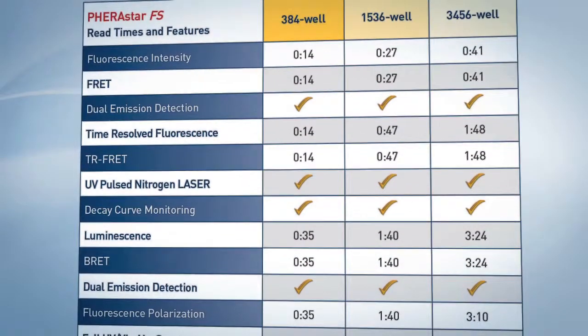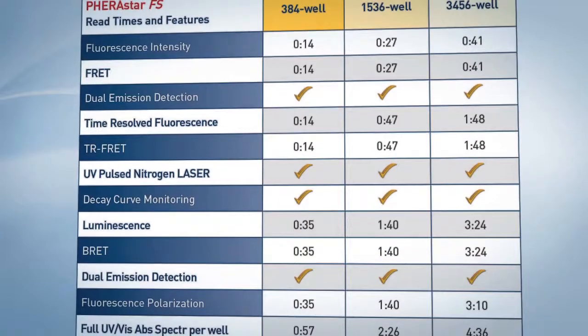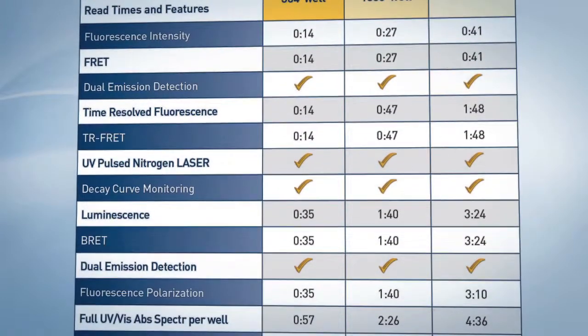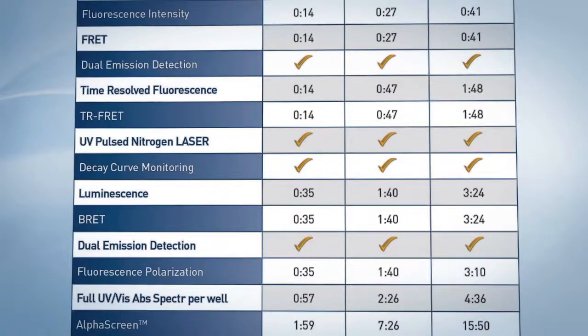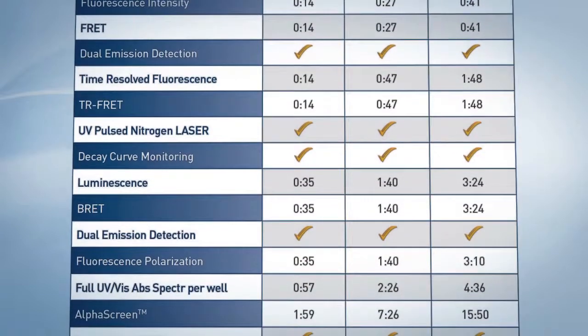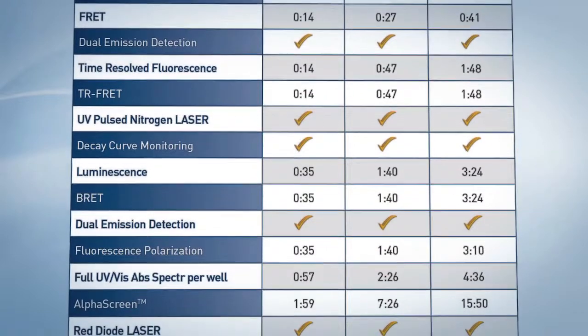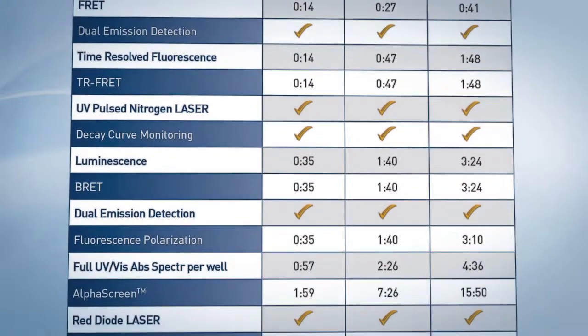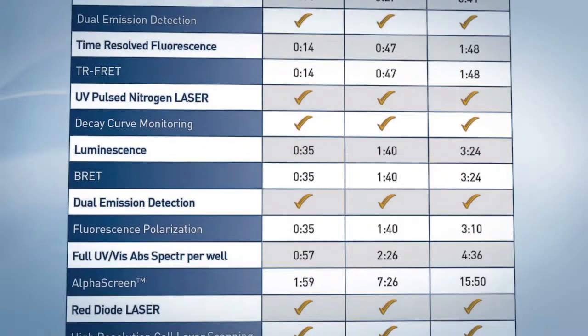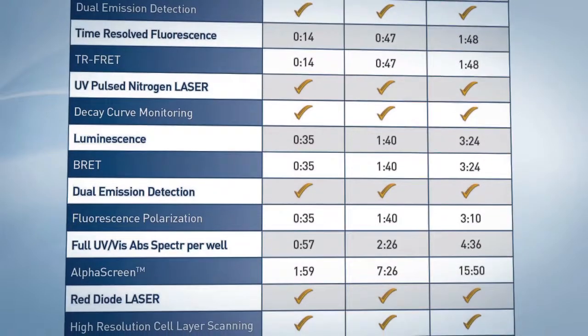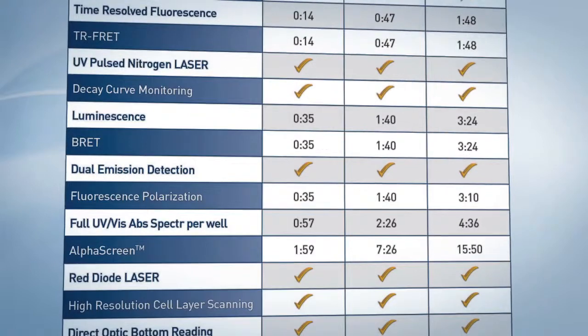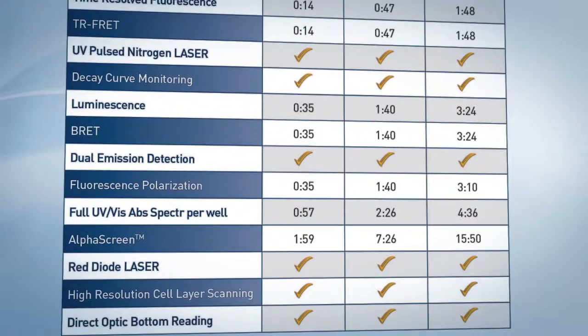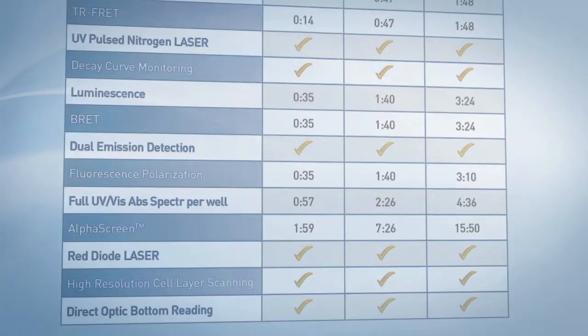Advanced assays such as FP, FRET, BRET, and TR FRET all greatly benefit from dual emission detection. In some assays, error rates are decreased by a factor of 1,000, allowing for greater sensitivity, larger windows, and higher Z prime values. This all adds up to one thing: the Ferristar FS can measure faster than any other microplate reader without sacrificing performance for speed.